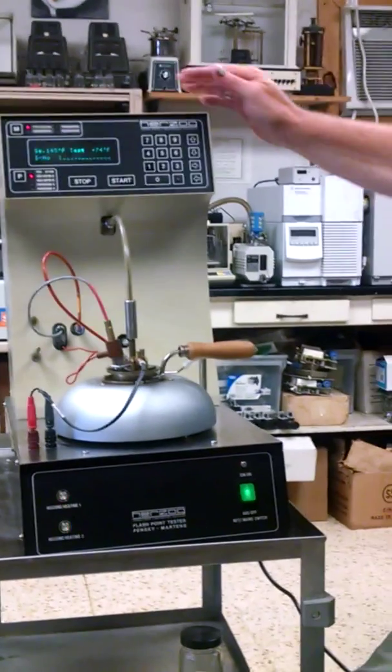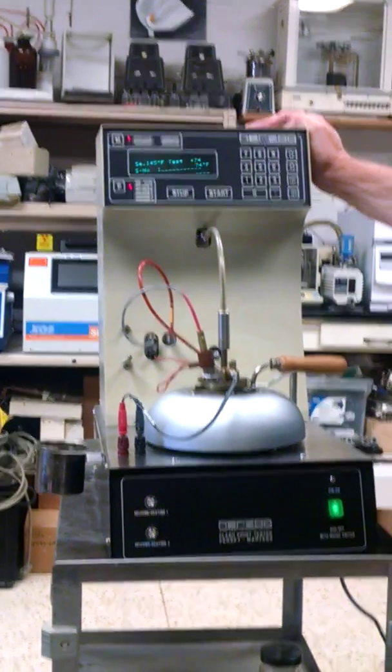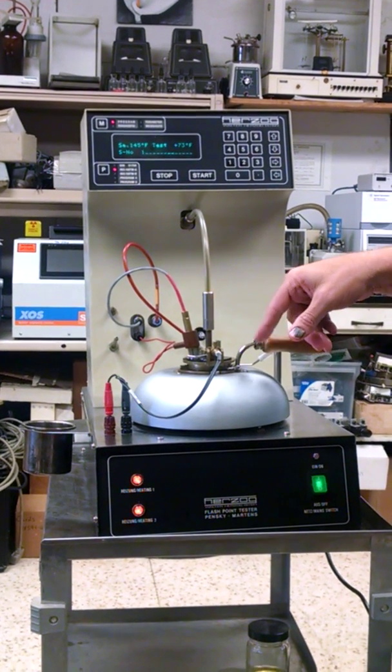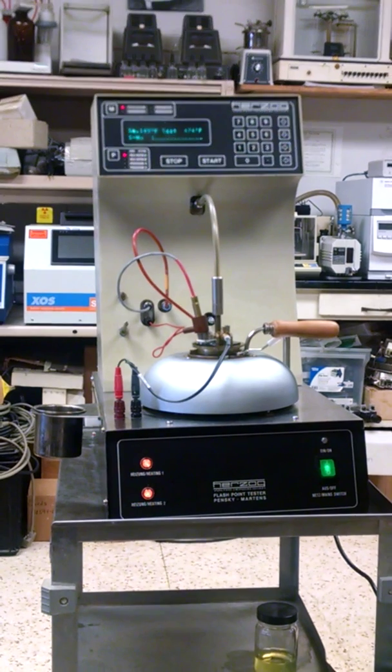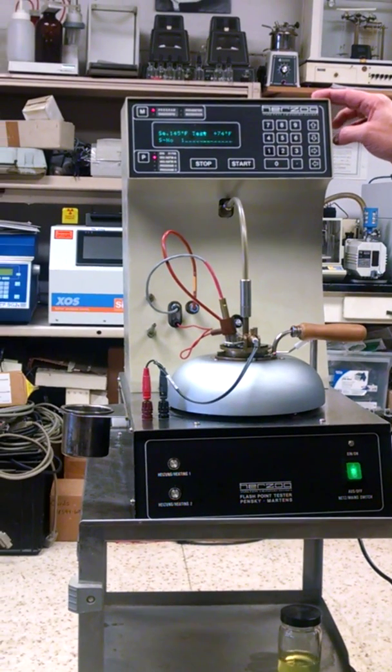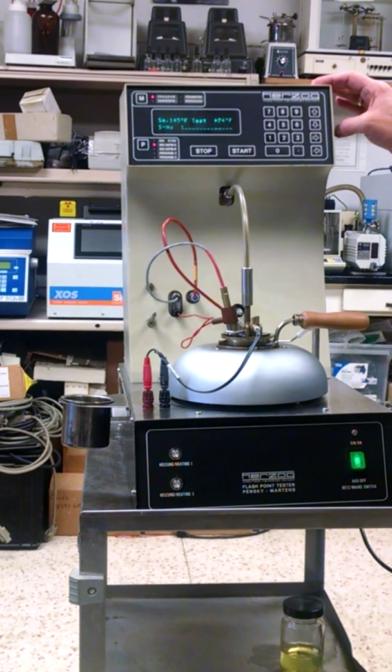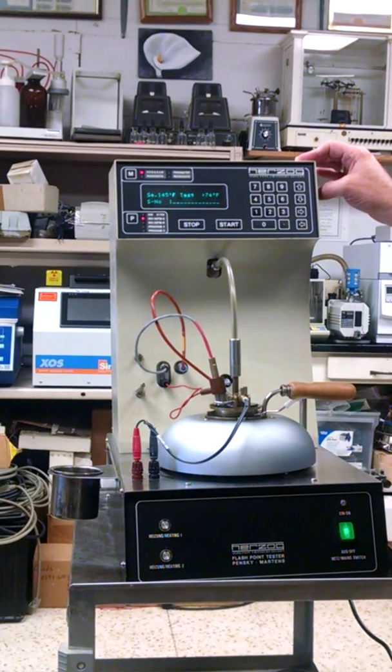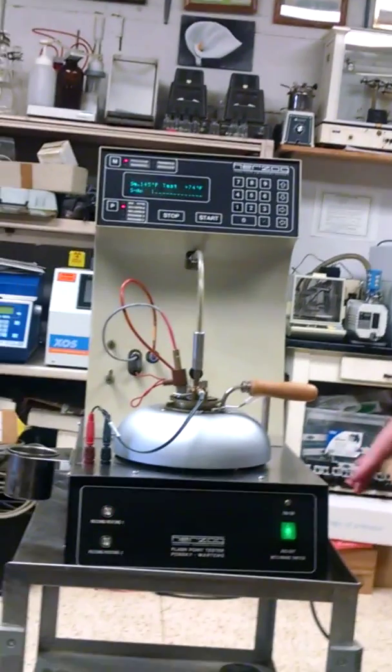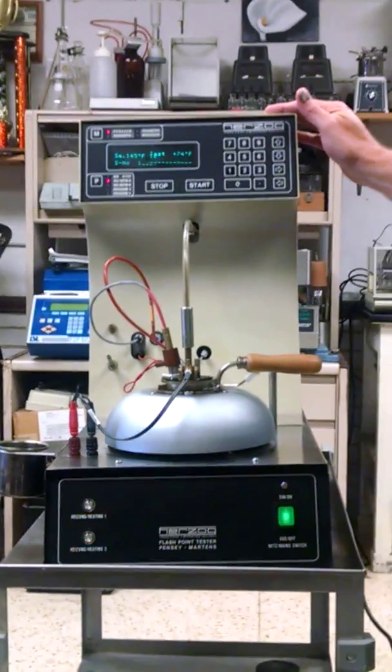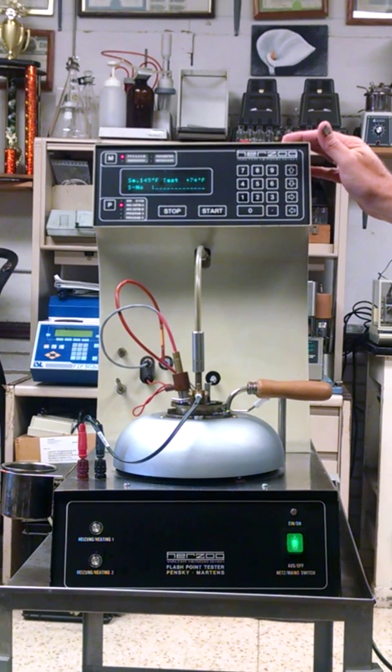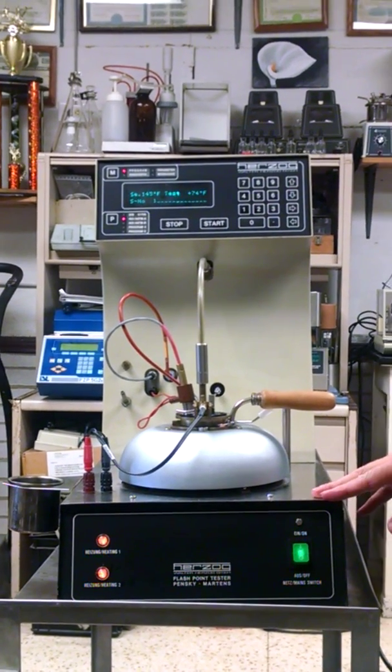Anyway this particular machine is a little older. We purchased this, it had bad cup arm, we replaced that and the cup wasn't working right, so we modified it and got it working right. So that's a pretty good flash point tester now. Typically to buy these new they're probably I would say twenty five thirty thousand dollars. This one we'd sell for fifty five hundred dollars, so that's quite a savings. Matter of fact even a manual flash point tester new is three thousand dollars, so you know for a couple thousand more you can have a really nice automatic flash point tester.